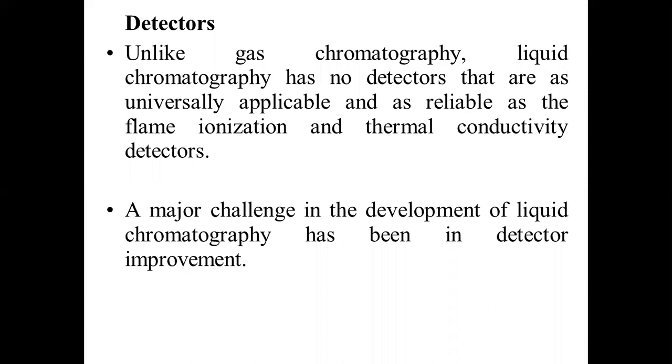After the separation is over, the quantity of the solute or type of the solute present in the sample will be derived from the signal given by the detector. So unlike gas chromatography, liquid chromatographic technique doesn't have any universal detector because HPLC will be used for the separation of all varieties of compounds.